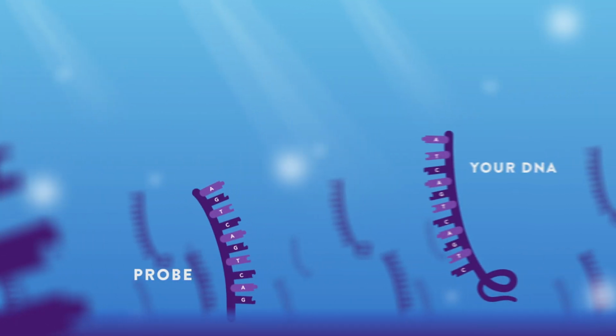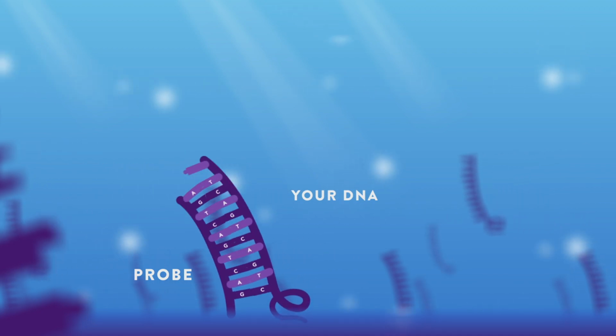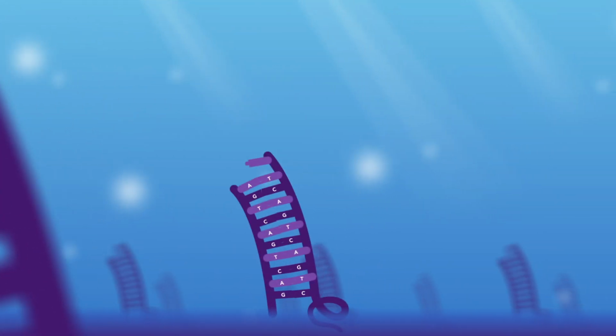So when we add your purified, chopped up DNA to your chip, it's a free-for-all. Millions of tiny chunks of your DNA are swimming around looking for their matching DNA Velcro probes. Kind of like trying to find your tiny genetic soulmate in a huge crowd. Aw, that's sweet. But it can take a long time to find your perfect match in a crowd. Fast forward about 24 hours, and by then, most pieces of your DNA have found their Velcro probe soulmates.